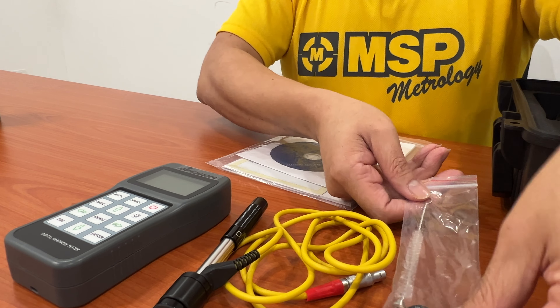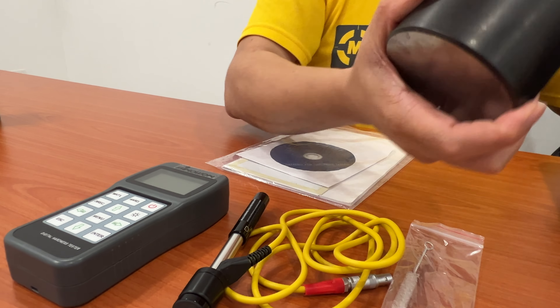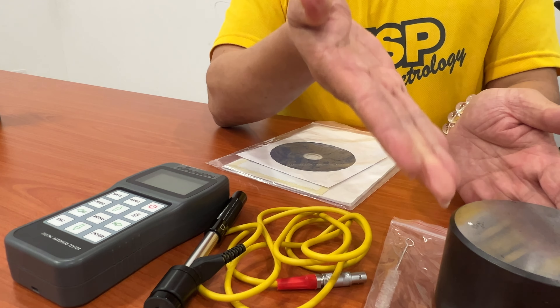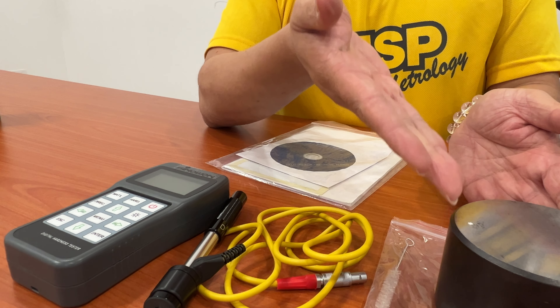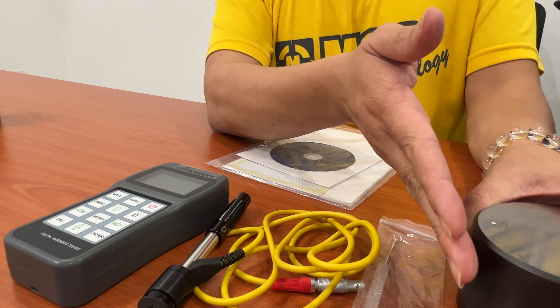On the other hand, we have one accessory — the brush to clean up the probe. There is also one test probe, which is for usage demo purposes. Normally, we will provide a new unit to our customer.